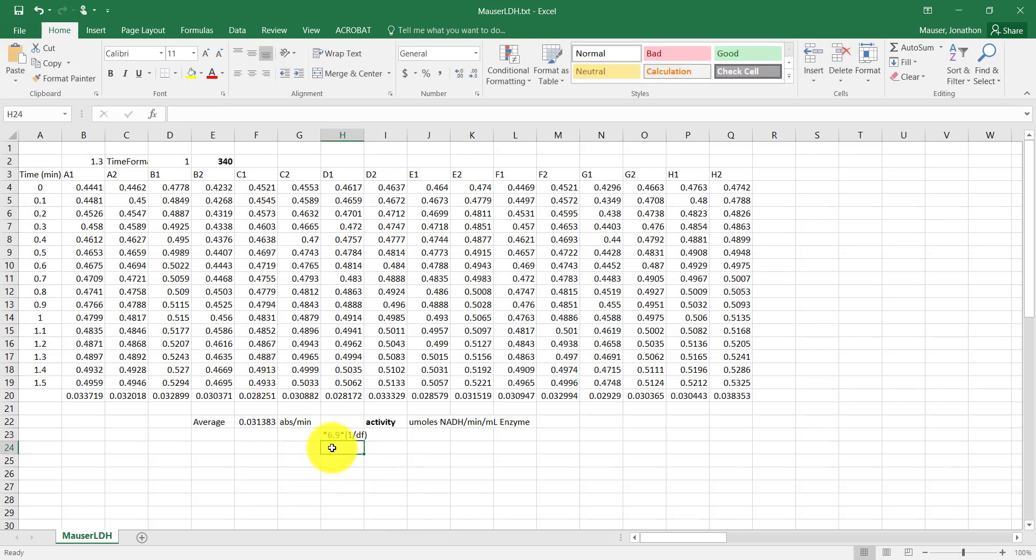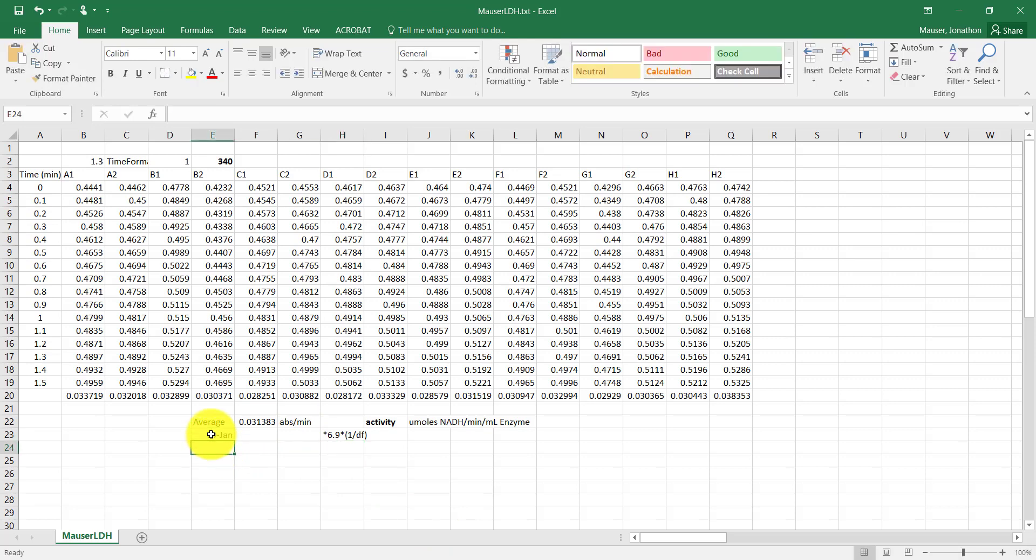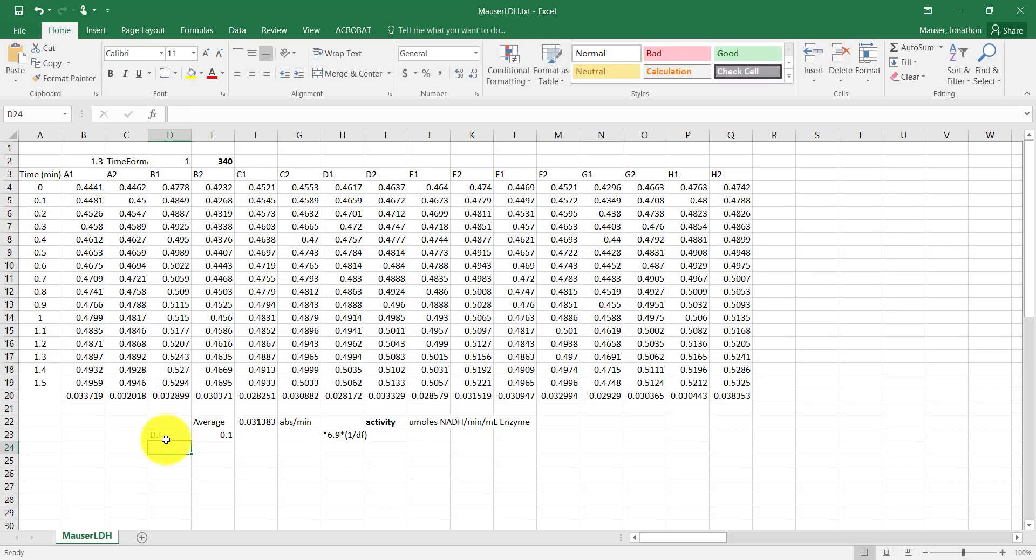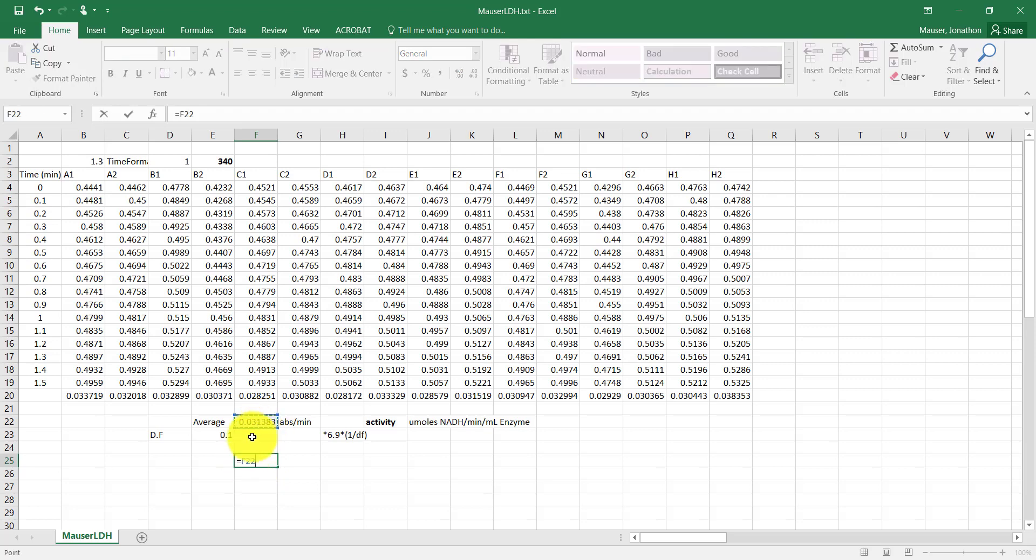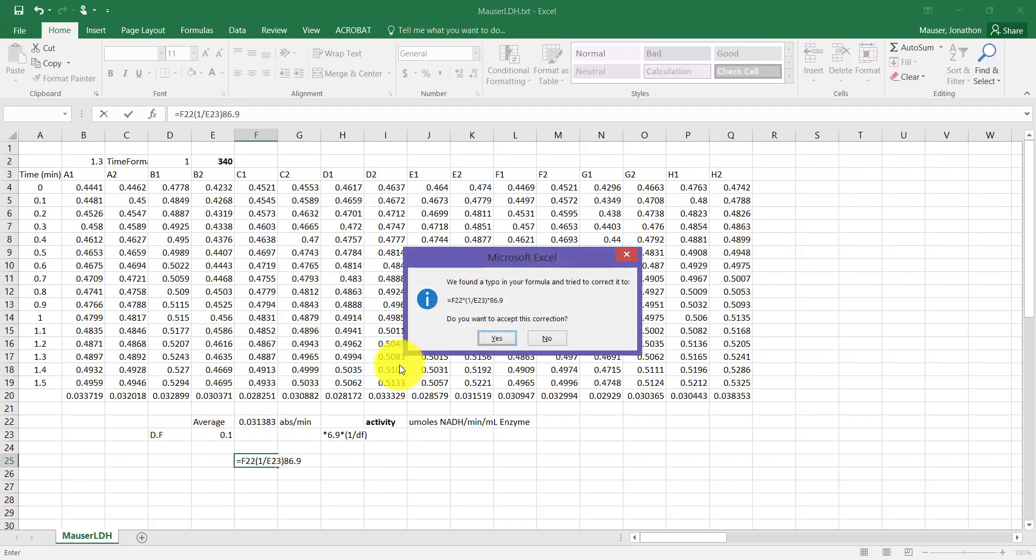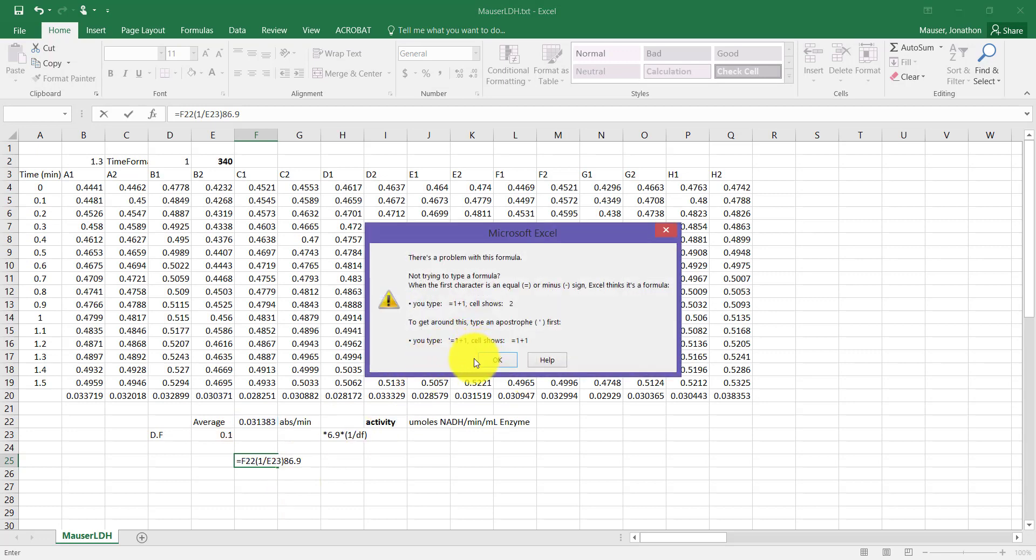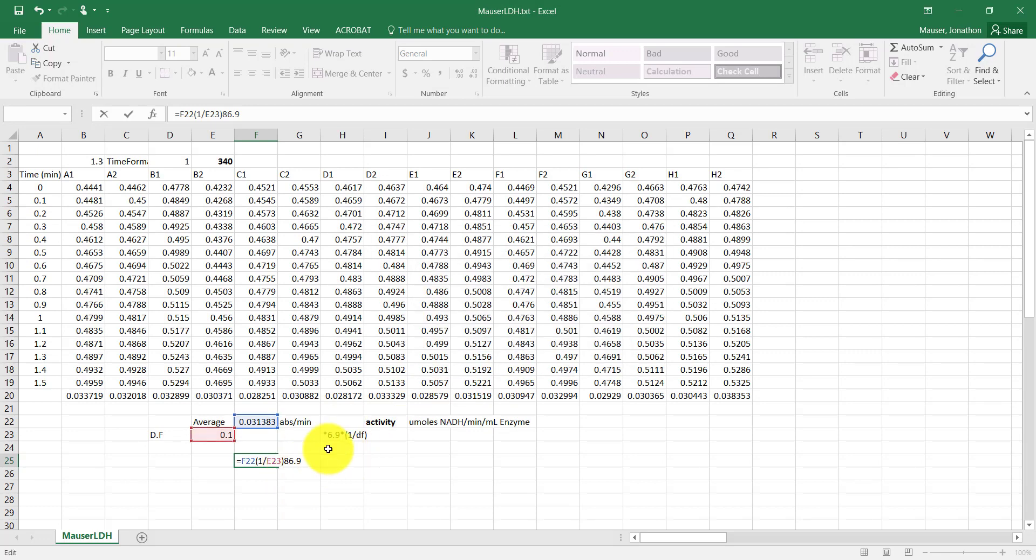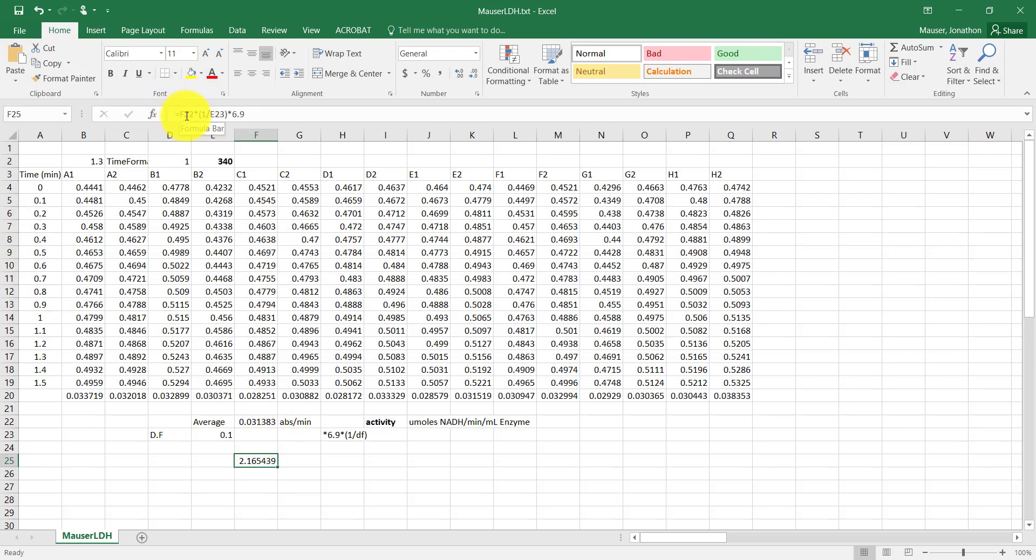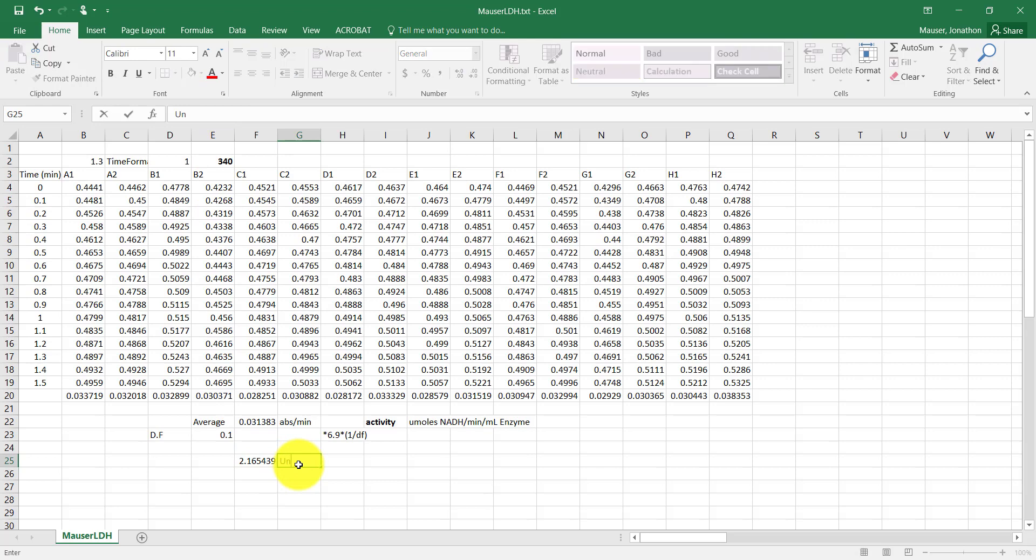So for me, I had a 1 to 10 dilution factor. So if I want to find my activity, what I'm going to do is I'm going to take my slope, my average slope, times my 1 over my 1 to 10, which is just times 10 really, times 6.9. So if you look at the formula up here, it's F22, which is my average absorbance times 1 over my dilution factor, times 6.9. This is my activity in units per mil. And again, a unit is a micromole of NADH per minute.